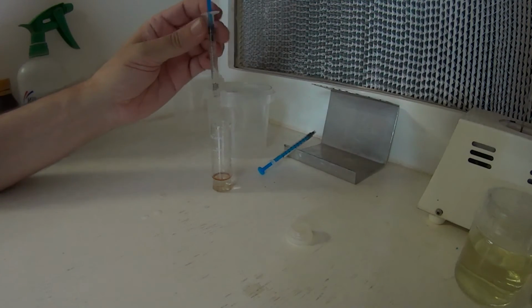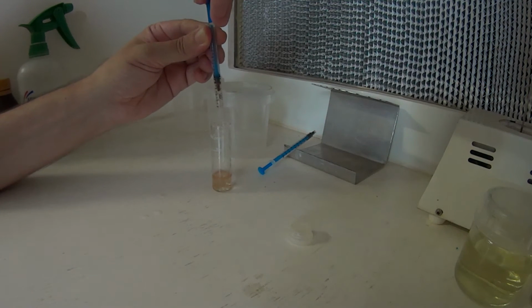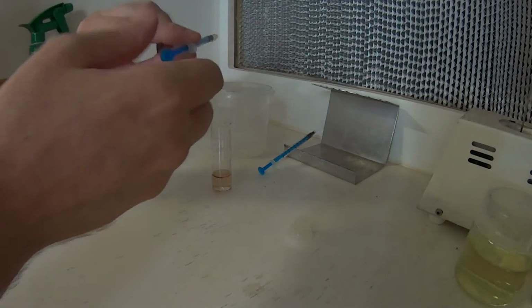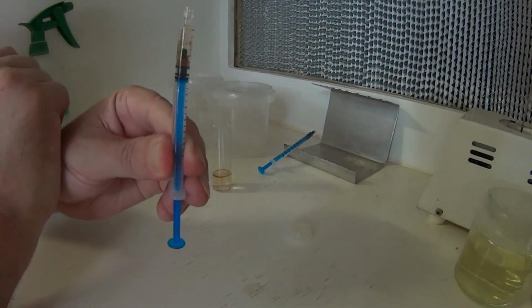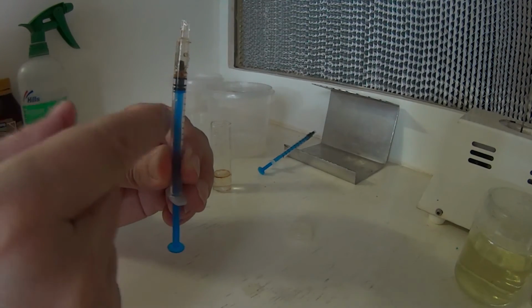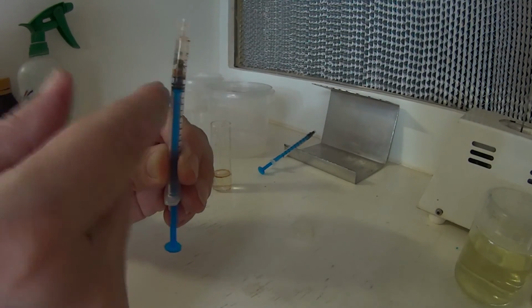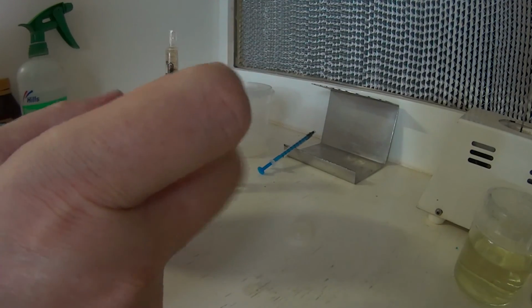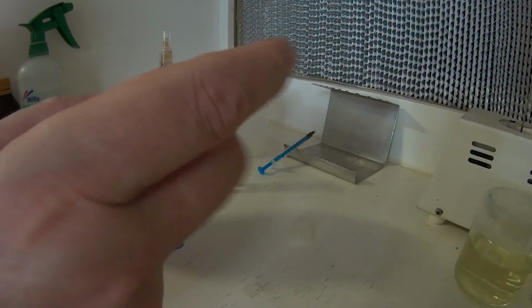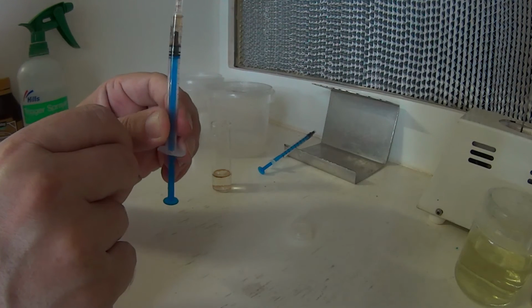Alright, so here we go again. We'll just simply squirt out most of this fluid, hydrogen peroxide, turn it down to a decent level, and just spin around, and once again, maybe not be able to see that, but our orchid seeds, most of them, will tend to float to the top. You're not going to get all this seed into these containers, but the sheer number of seeds that are here, it should get a fair few into the containers.